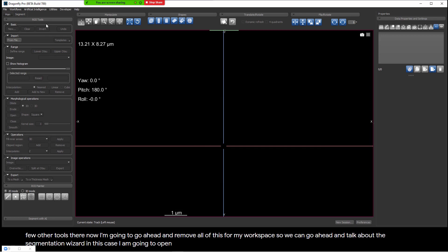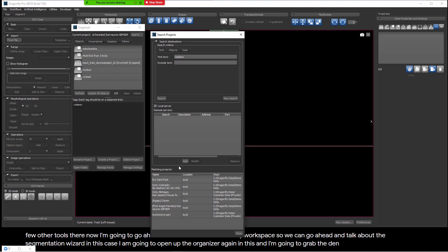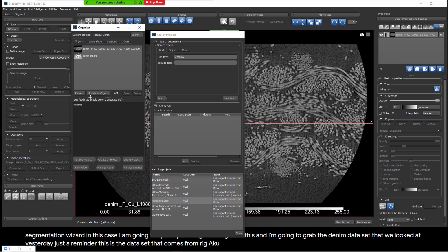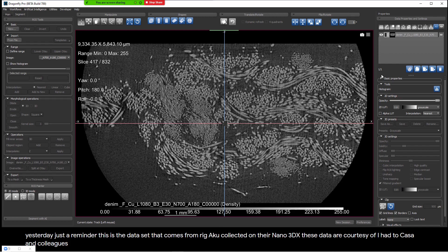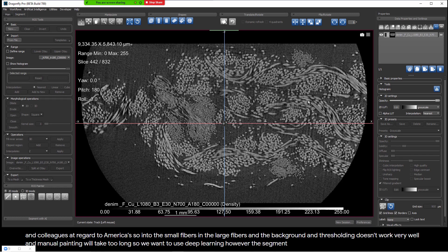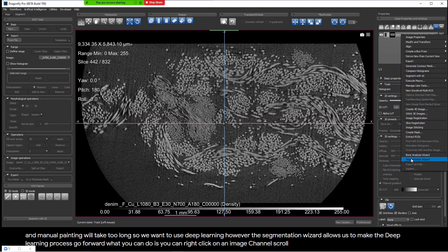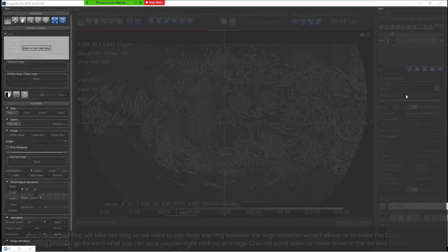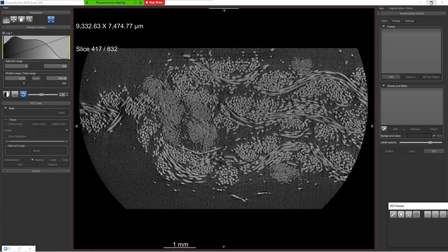I'm going to open up the organizer and grab the denim data set we looked at yesterday. Just a reminder — this data set comes from Rigaku, collected on their Nano 3DX. These data are courtesy of Aya Takasa and colleagues at Rigaku Americas. I want to segment this: the small fibers, the large fibers, and the background. Thresholding doesn't work very well and manual painting will take too long, so we want to use deep learning.